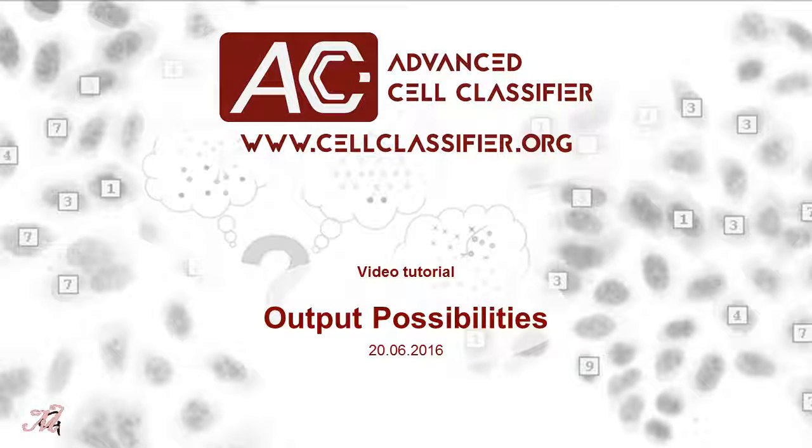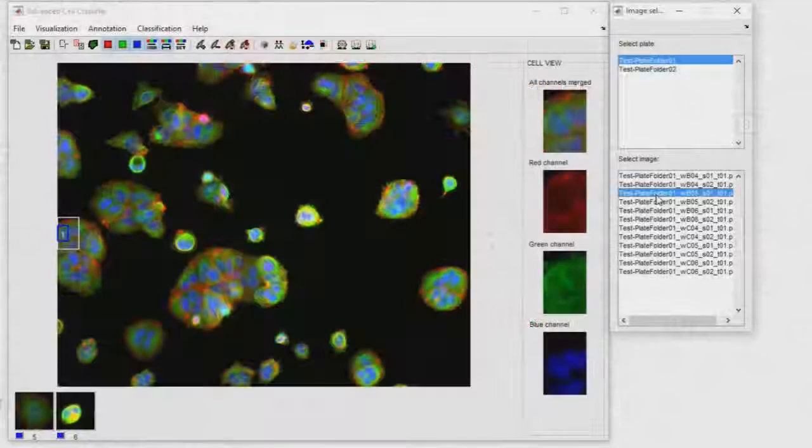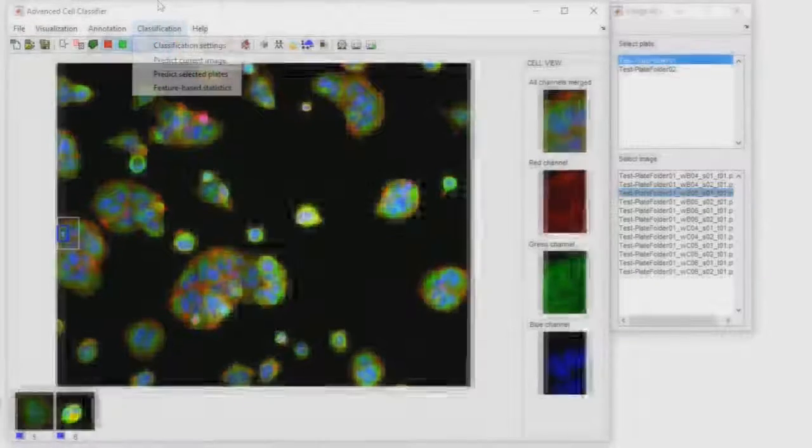Welcome. In this video tutorial, I will briefly describe the output possibilities Advanced Cell Classifier provides, and I will show you how to create reports of your data. To obtain output from Advanced Cell Classifier, the user must have previously defined classes of interest with annotated cells and must have a trained classifier.